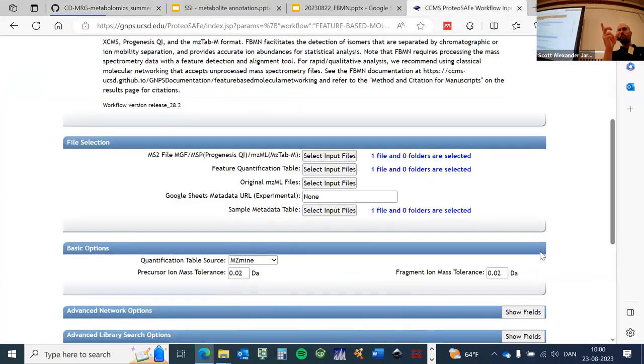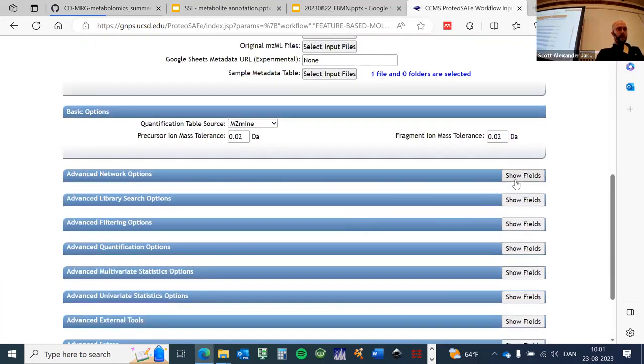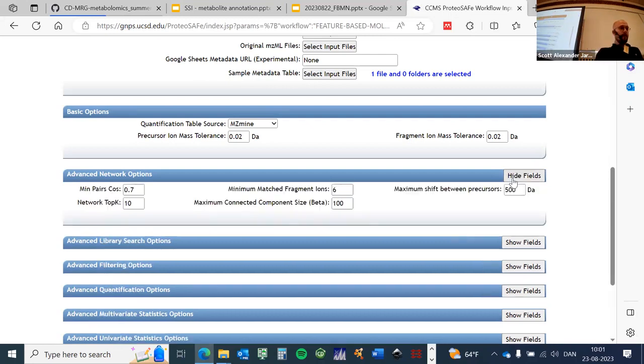So someone pointed out, you have your files here. You should have 4 files uploaded. Your metadata one doesn't appear here. It's just because there's not a prompt for it. But if you've uploaded it into the input screen, it's there. And then these other fields we don't have to play with. I can just show you briefly.